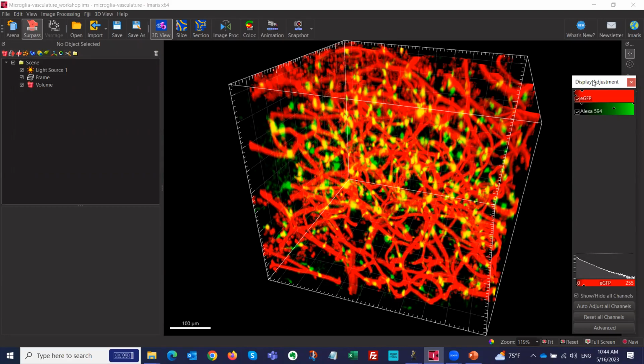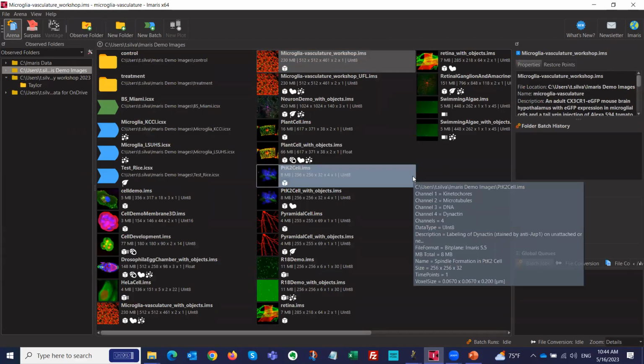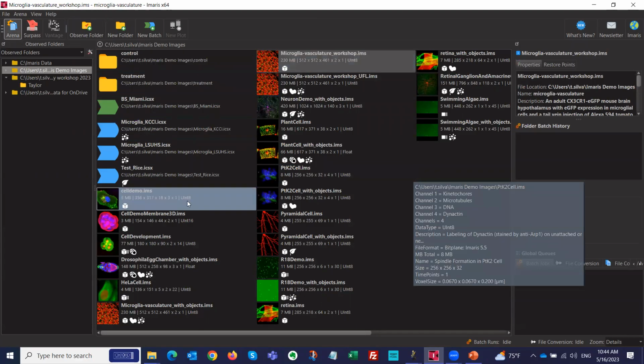Yeah, thank you. So we did not record a PowerPoint presentation, but I'm going to start here from zero, from the hands-on session in Imaris. So this is the recording here. If you've opened up Imaris, and let's say you've never used Imaris, this is how it looks like. This is what we call the arena view. These are the demo images.